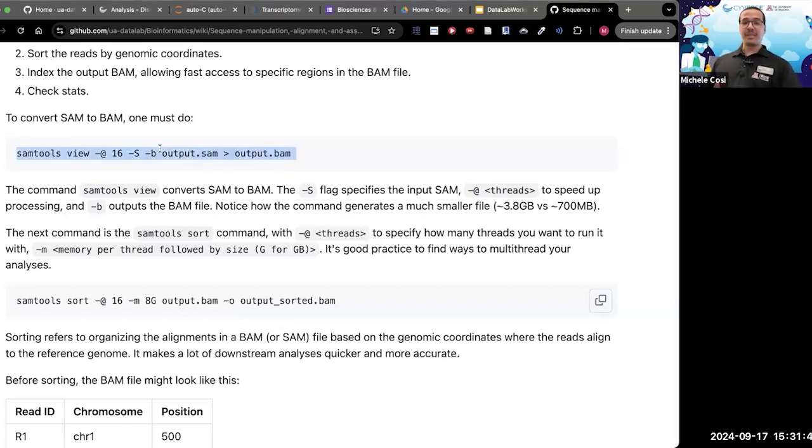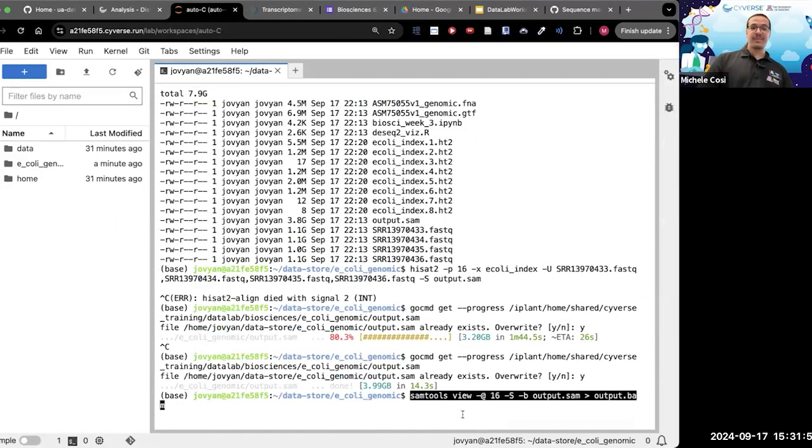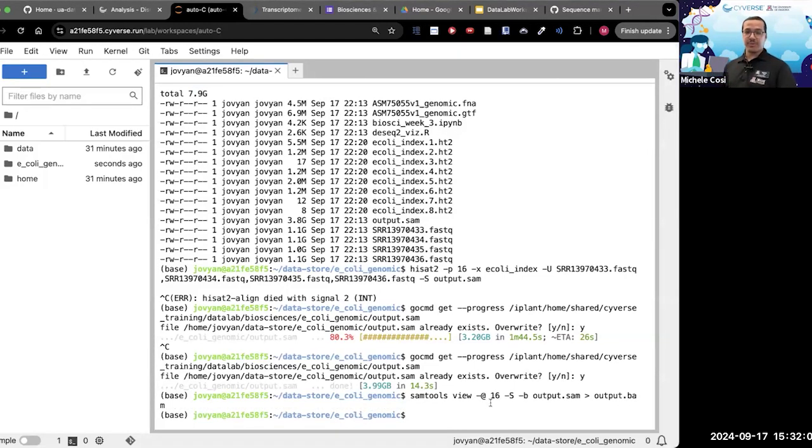So I'm just gonna copy this and paste it into the chat for y'all to run. I'm gonna go back to over here where I am also just going to paste it and press enter. Shouldn't take long. What am I doing here whilst this runs?